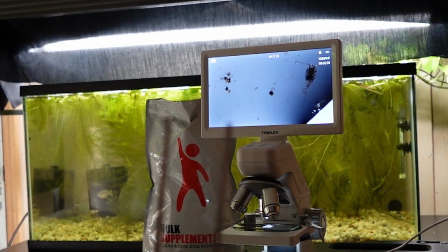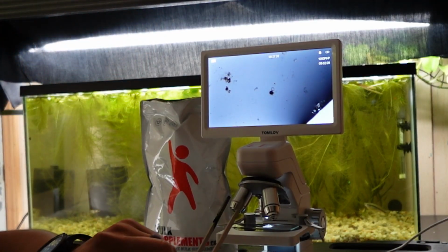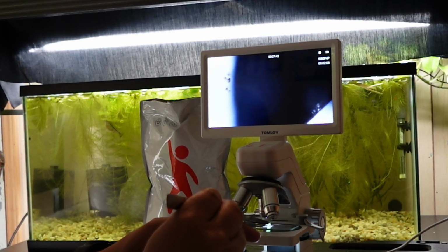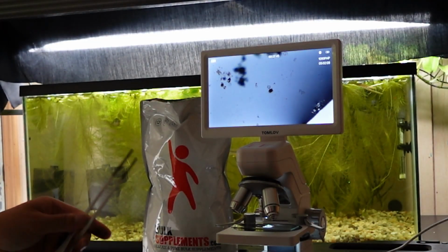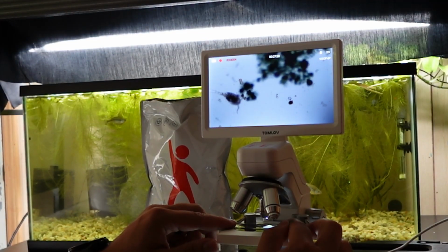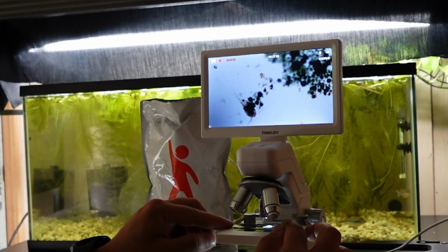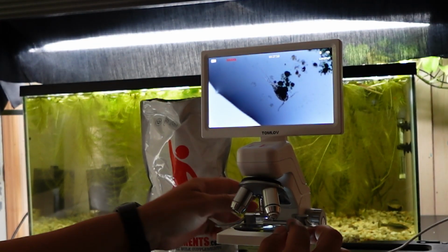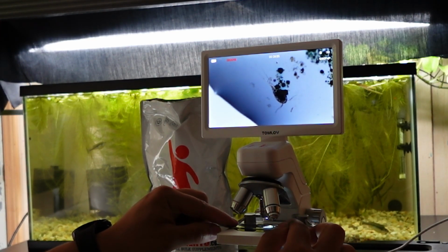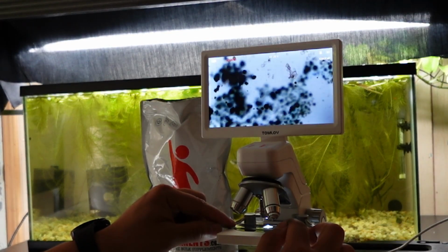All right, I'm about to put the tiniest bit of spirulina powder inside this little droplet here. So let's see if we can make that happen, and then let's see what it does. Oh, he's eating it, guys. He's eating it. He's legit eating it. You can see him munching on it right now. This copepod, or whatever it is, is 100% eating that spirulina powder.